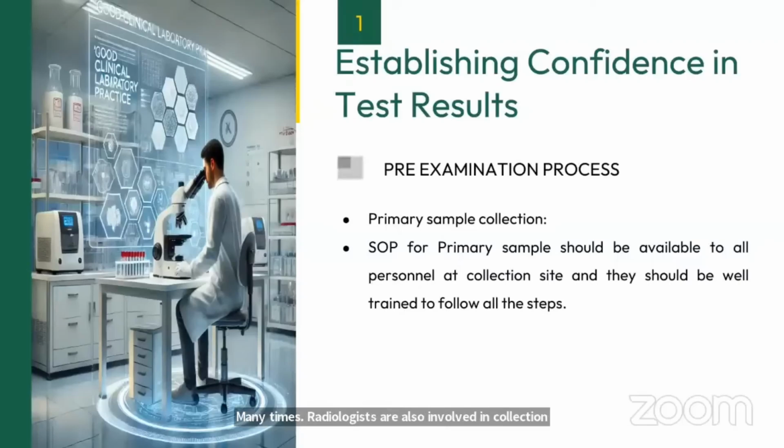So all those persons must be aware of the collection procedure. What are the precautions they should follow while collecting? Immediately after collection, how should the specimen be preserved so that the integrity remains? So they should be aware of all the standard operating procedures.